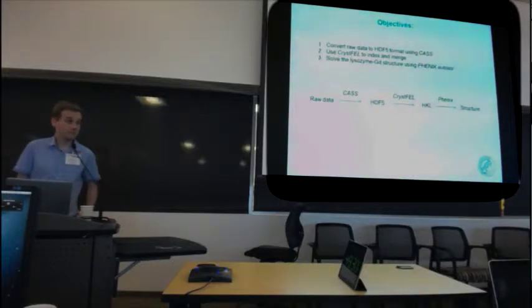Karol, do you have an online tutorial, or is this the only one? Do you have access to it? So I have notes written in the Scratch folder that explain all the points that have to be made in order to do this. And I think this slide also will be available. But I don't have an online tutorial now.